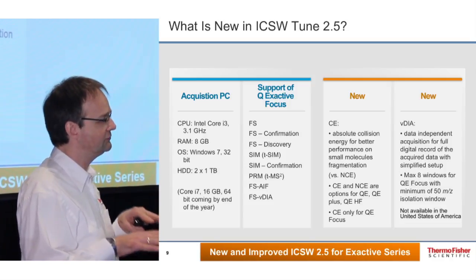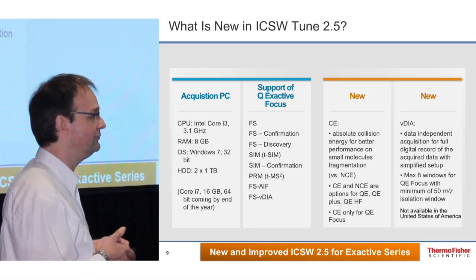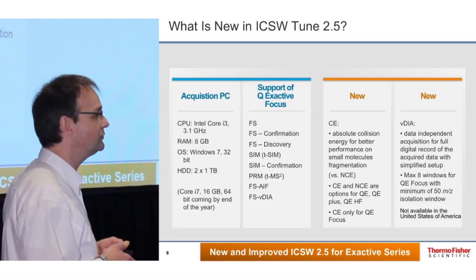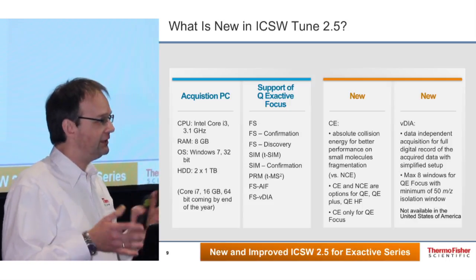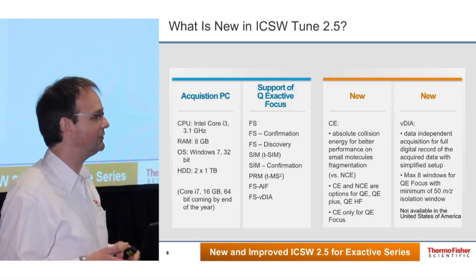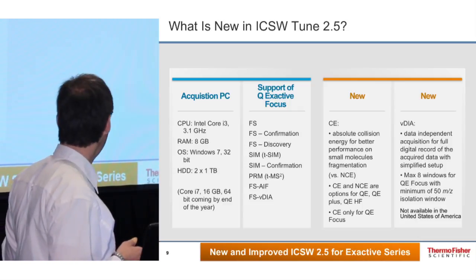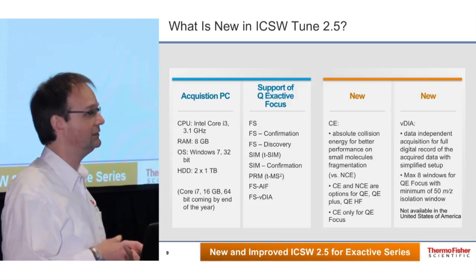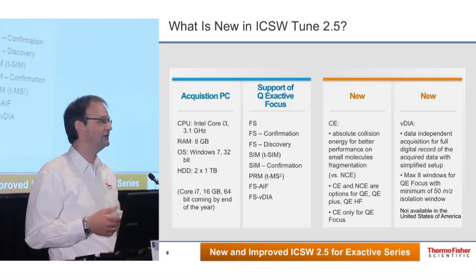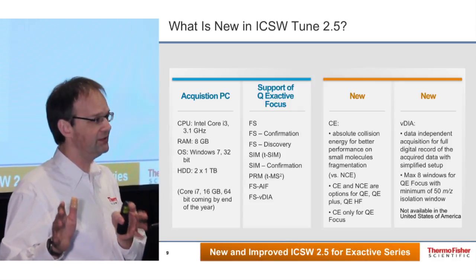So the low-level components you will not detect most likely with such a scan mode that's more for metabolite ID than for quantitation. We have the SIM mode with up to 10 times more sensitivity for specific detection of a lower number of components if sensitivity in full scan should not be enough. PRM going the same way with added selectivity. Full scan AIF, that's known from all Exactive instruments so far. You have the full scan and the fragmentation of all ions together.